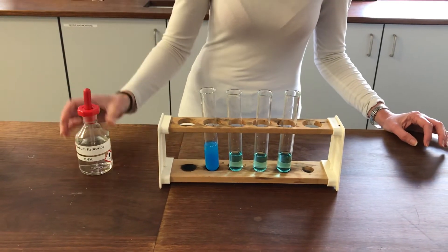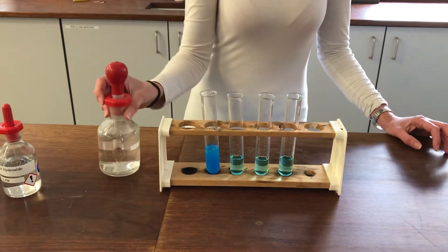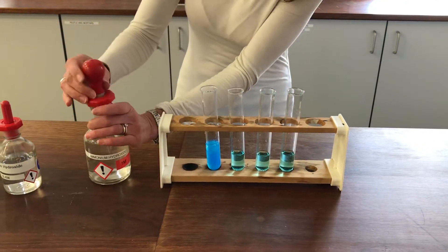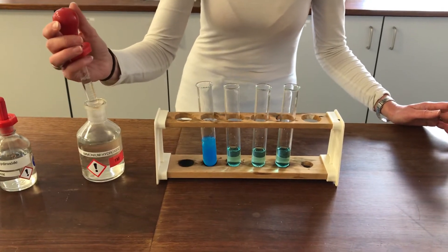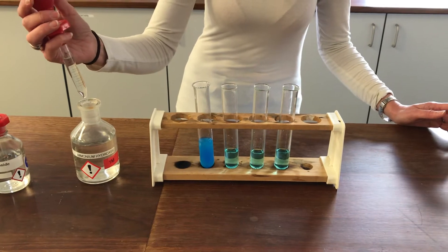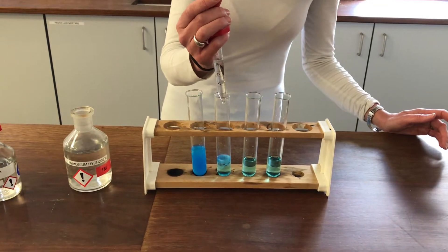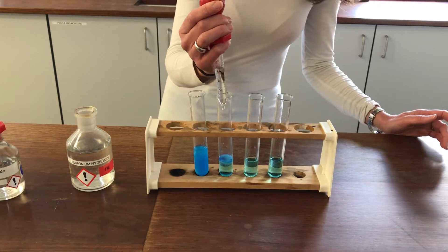I'm going to try the second boiling tube and add ammonium hydroxide so that we can compare and contrast. Ammonium hydroxide obviously has hydroxide ions in it as well, so when we add this we should expect to see the same initial reaction as the hydroxide ions deprotonate the water ligands around my copper complex. And you can see we're genuinely getting that blue precipitate forming of copper(II) hydroxide.